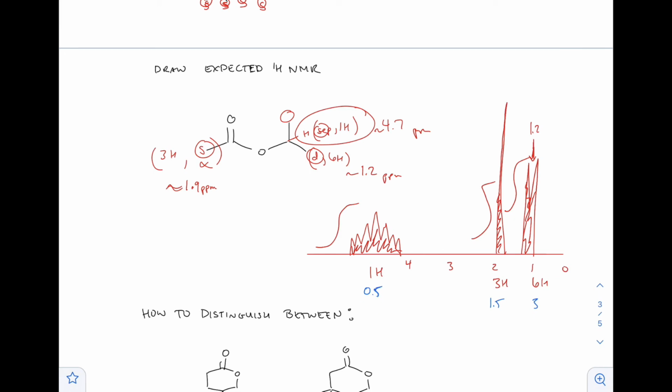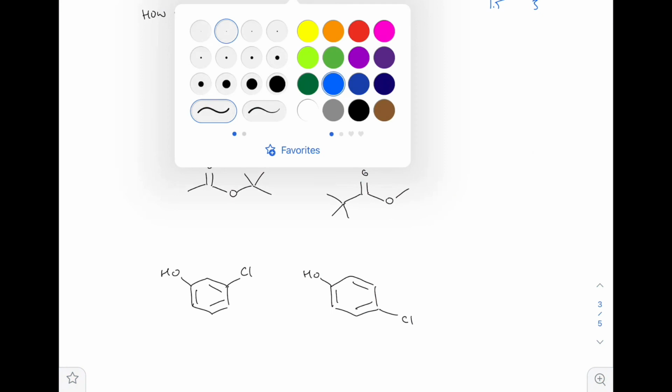So we would have to at least multiply it by 2 to normalize it to get to the 1, 3, 6. But if you do that and it still doesn't make sense, like, let's say you didn't have a single proton present, well, then you'd have to make it 2 and then double everything else again. Okay, so that's the process you want to approach.